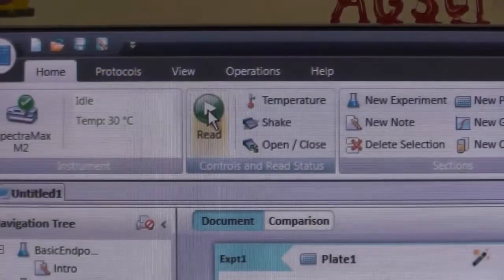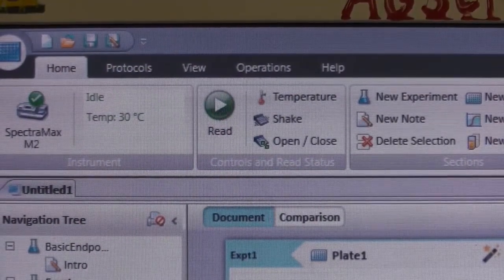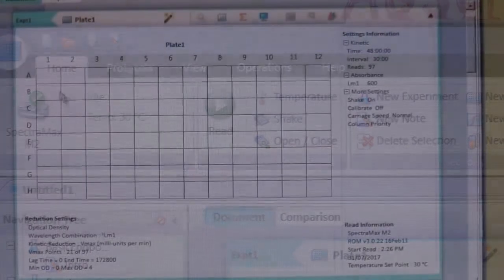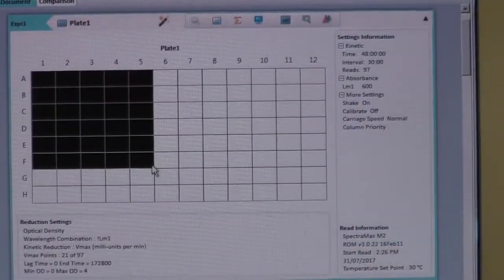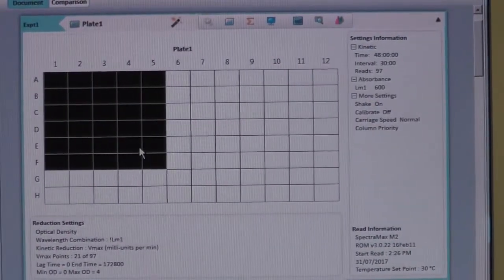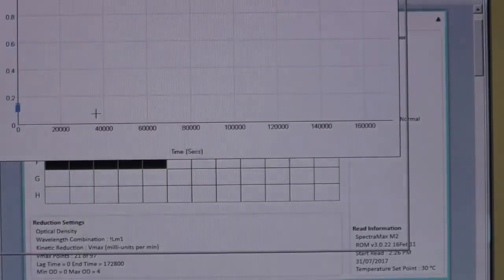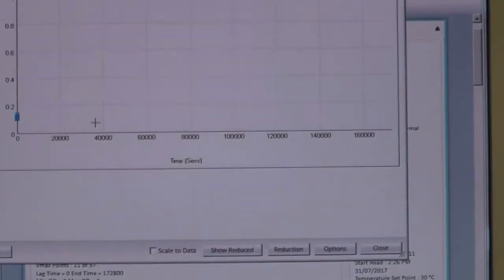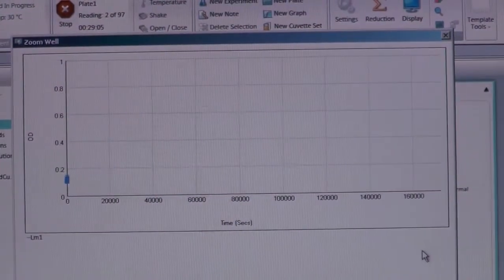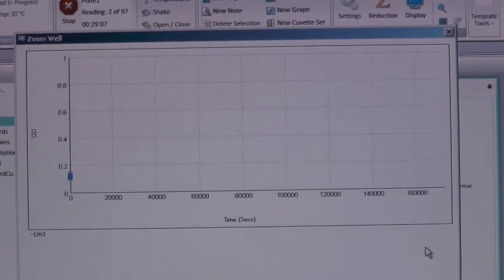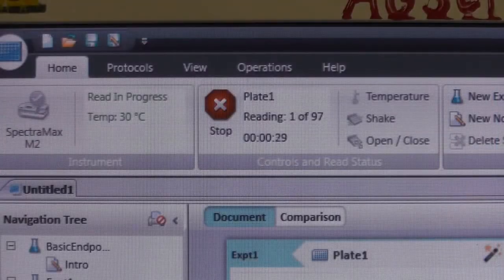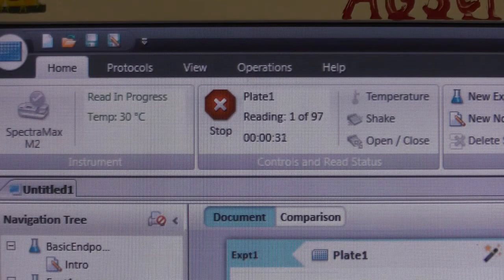When you're ready, select the Read icon. The machine will start running. To view the progress of your readings, click and drag to select the wells you want to view. Then hold down the Ctrl key while double-clicking the selected area to bring up the progress graph. At any time you wish to stop the reading, click on Stop.